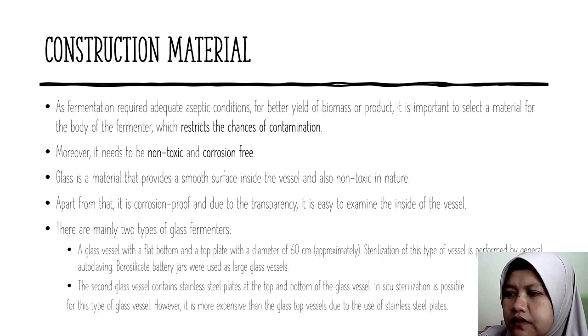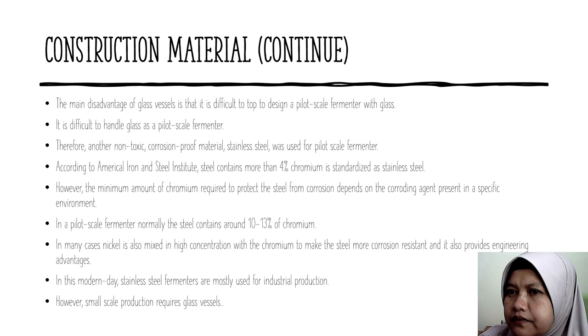In situ sterilization is possible for this type of glass vessel. However, it is more expensive than the glass top vessel due to the use of stainless steel plates. The main disadvantage of glass vessel is that it is difficult to design a pilot scale fermenter with glass. It is difficult to handle glass as a pilot scale fermenter. Therefore, another non-toxic, corrosion-proof material, stainless steel, was used for a pilot scale fermenter.